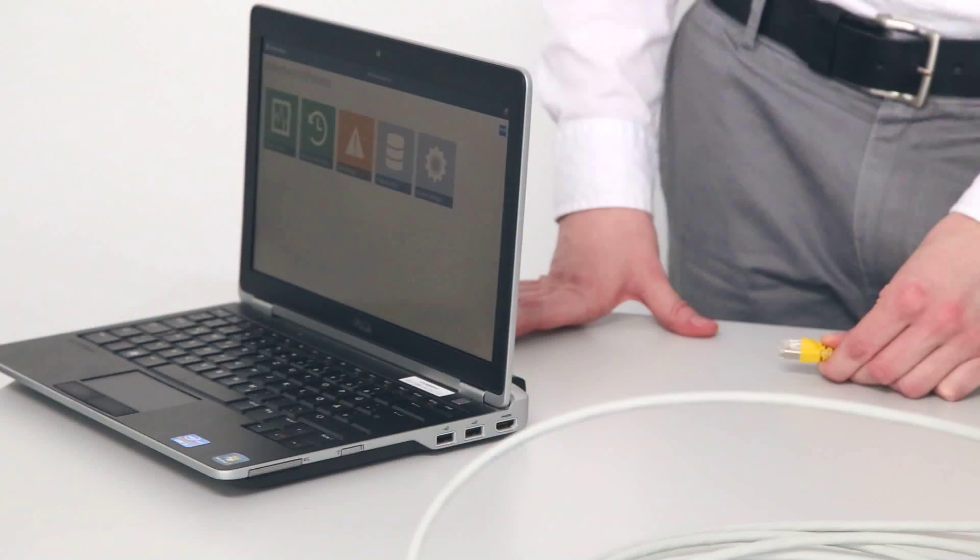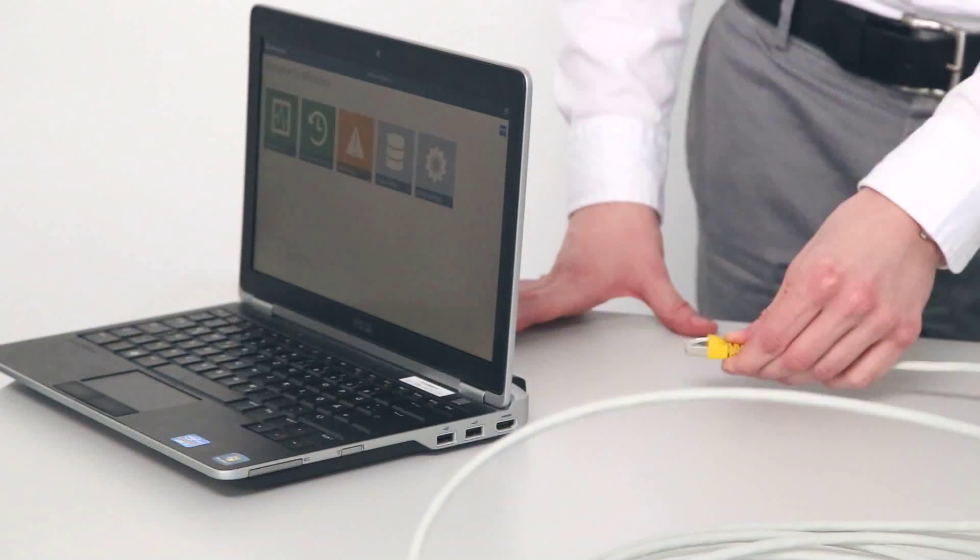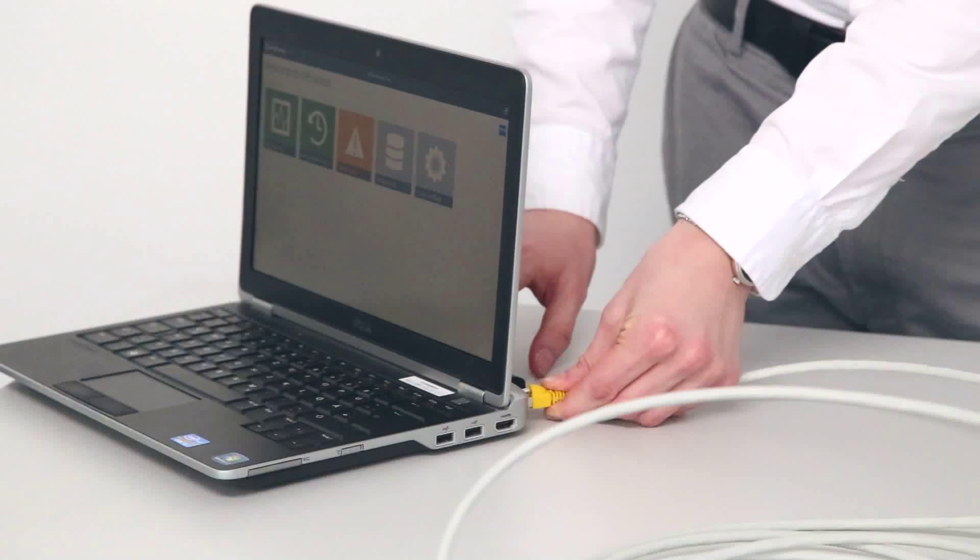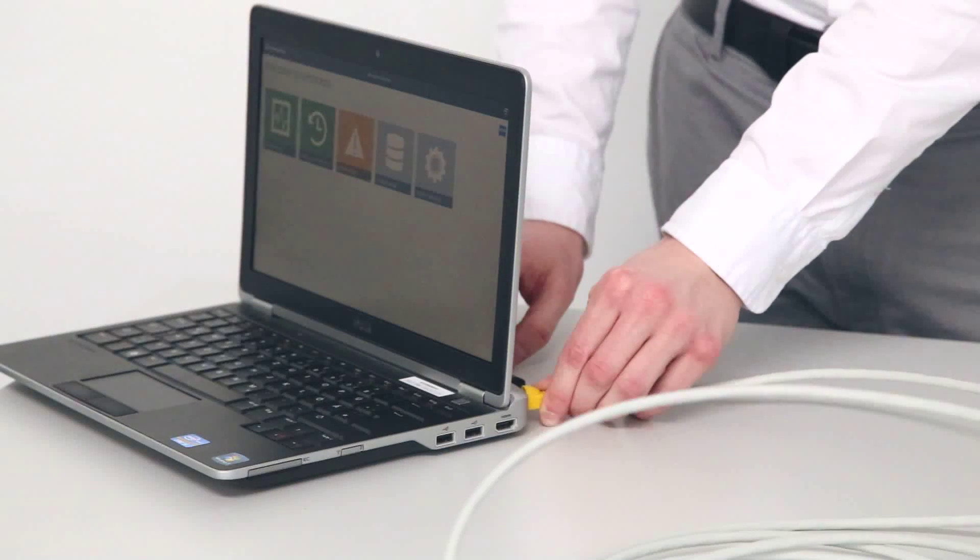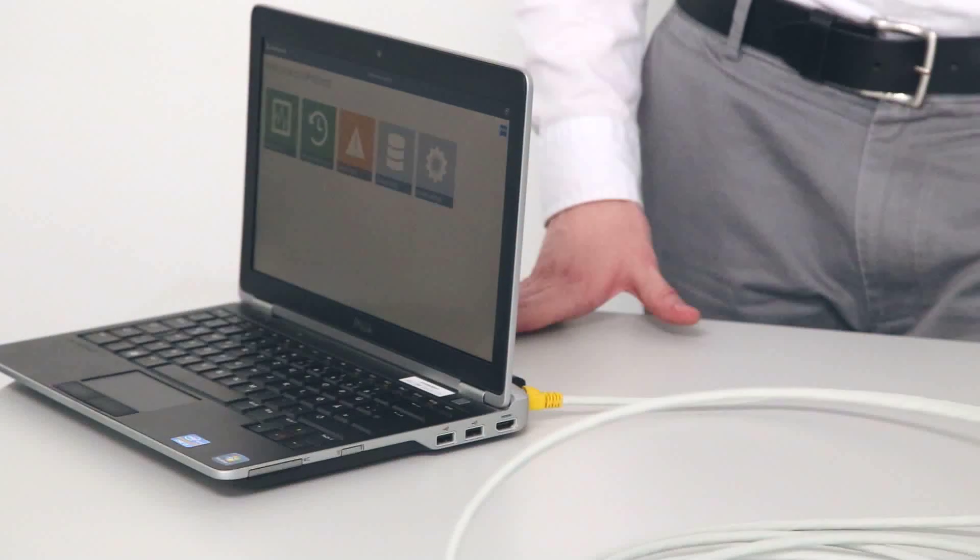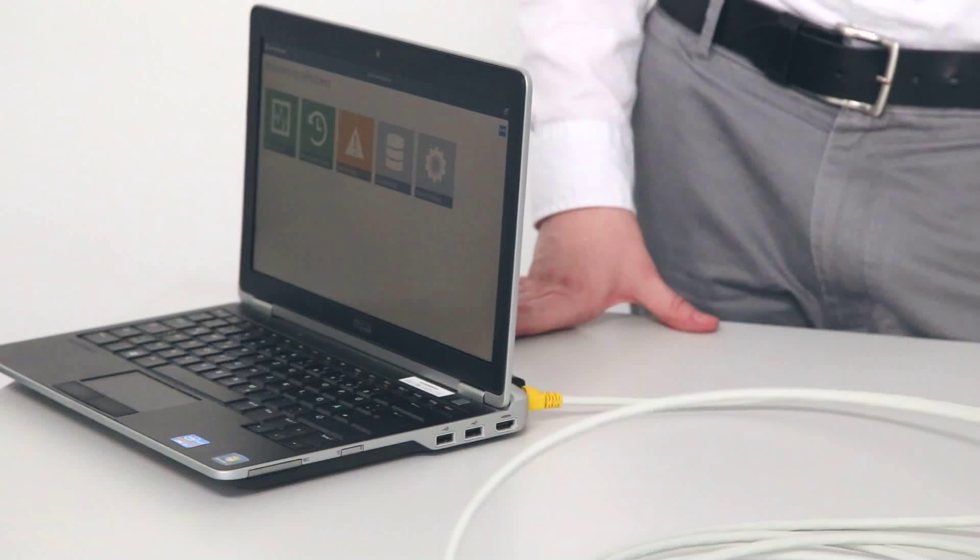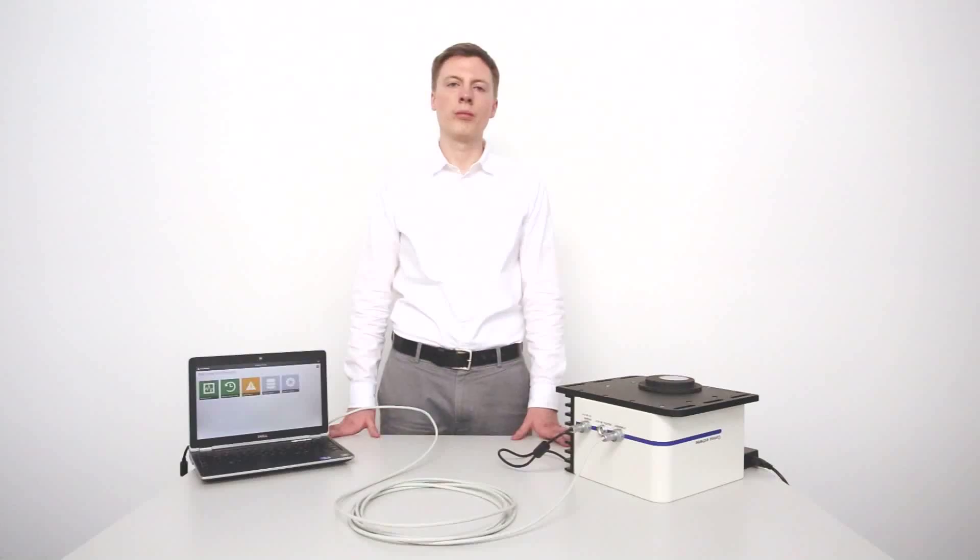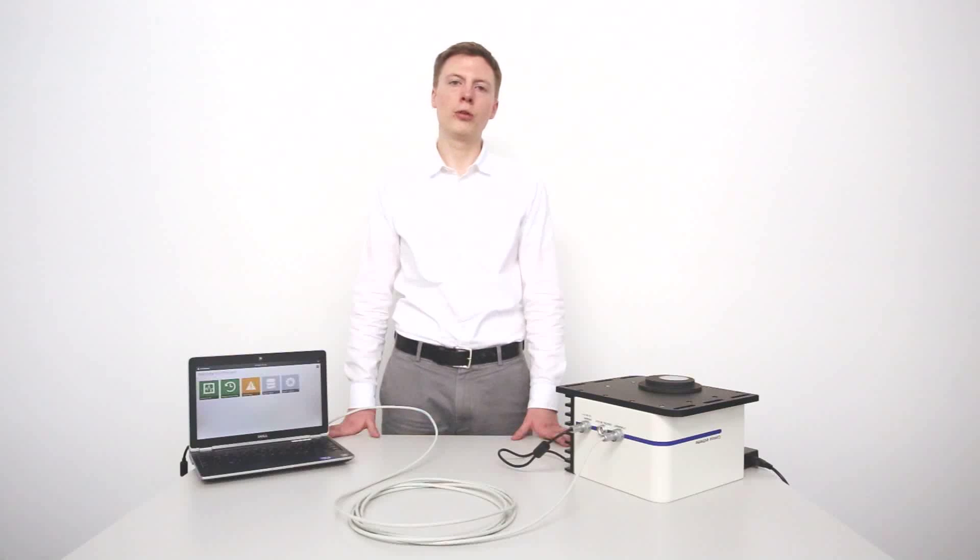After that you can connect the Ethernet cable to your PC. Now the Corona Xtreme is ready to be used by the in-process software.